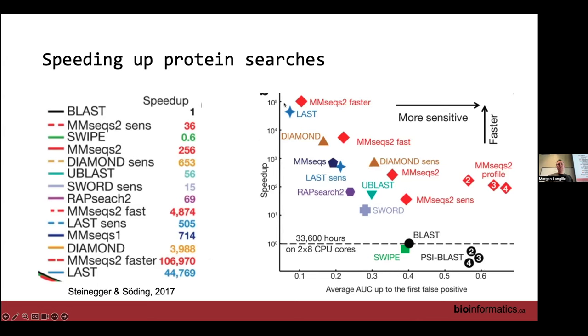Could they be missing genes in the pathway though, and then other bacteria in the same environment can fill those parts? Yes. So the problem here is once we get into things that aren't as well characterized, obviously we haven't described all the functions of genes at all. And so there definitely could be a new gene that's not described by a KEGG ortholog here that fulfills one of these steps, right? They were like, with glucose metabolism, not all bacteria remove glucose from host proteins, but most bacteria consume the glucose. So some bacteria would have the whole pathway, other ones would just have chunks of it, but they could still utilize the pathway. Yes, absolutely.